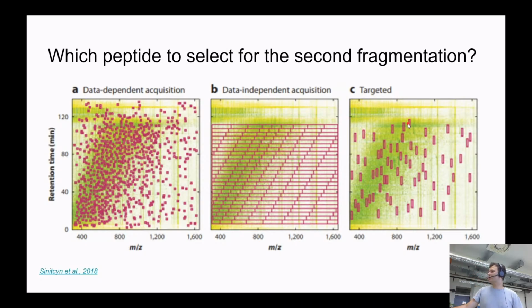Okay, cool. Targeted proteomics is not so scalable. It's not so much discovery in the sense of data-dependent acquisition. It cannot measure 10,000 proteins. It can measure way fewer, but very reliably. So data-independent acquisition, which stands against data-dependent acquisition, is actually some sweet spot between these two poles, let's say.